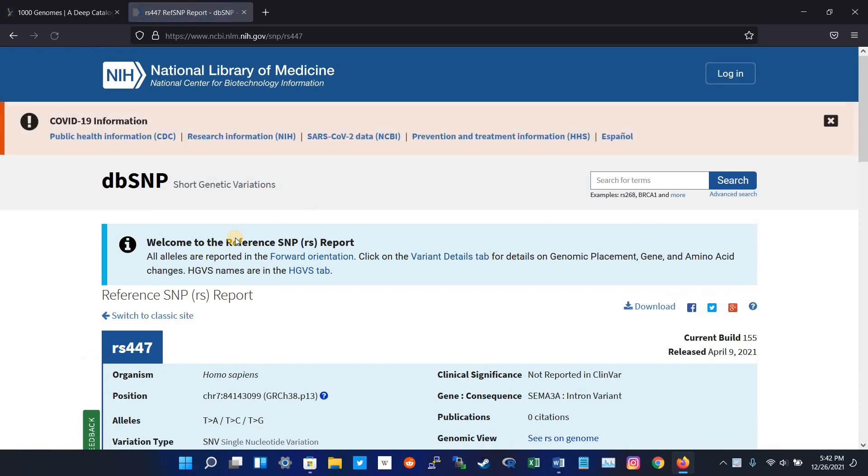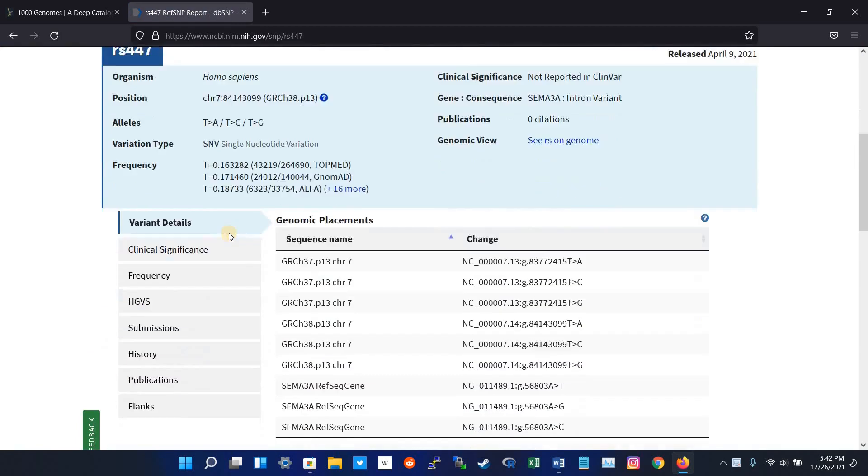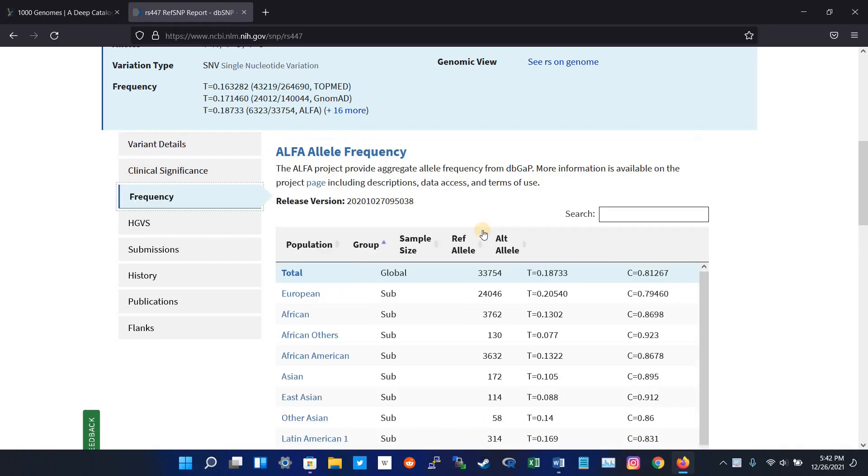The new page opens. Now I have to go down. Here is an option for frequencies, and I click the frequency.